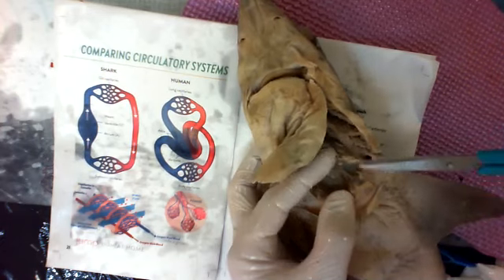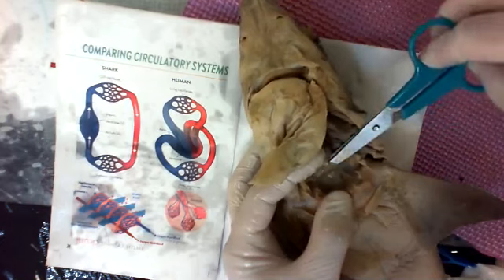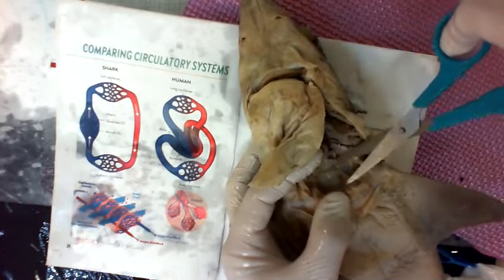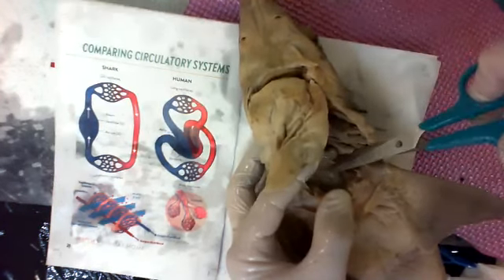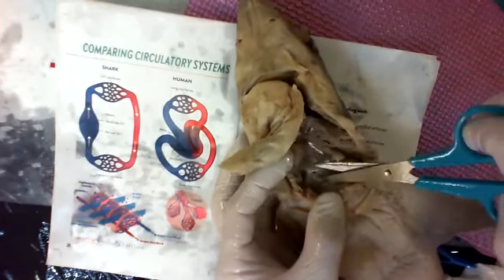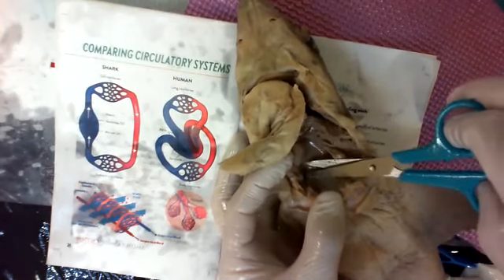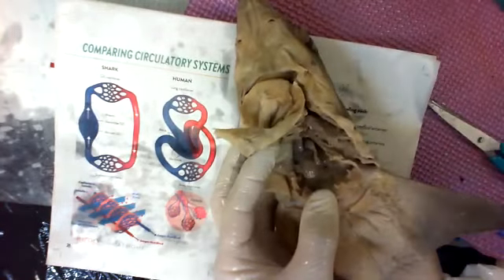I want to cut that blood vessel, so I'm going to be very careful. I'm feeling under it. I can feel I'm under that pocket. I can see my scissors right through there. I'm just going to go in like this. Take the same path. I know it's clear because I just stuck my scissors in, and I'm going to snip that path apart. Cool. Right. There's a little bit more right here. Got it. Got it. Now I should be able to take my tweezers and pick up my heart.